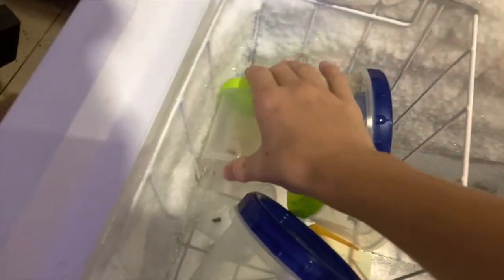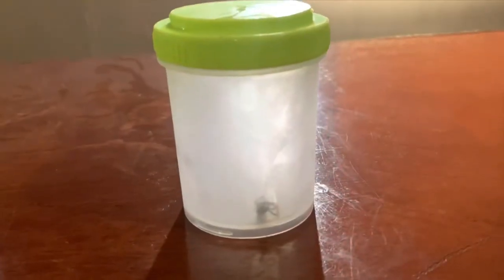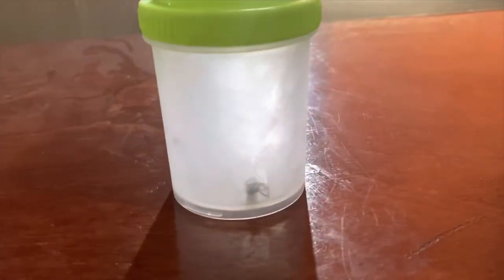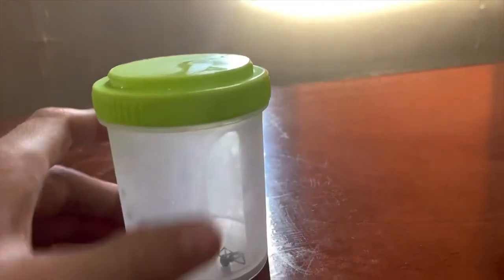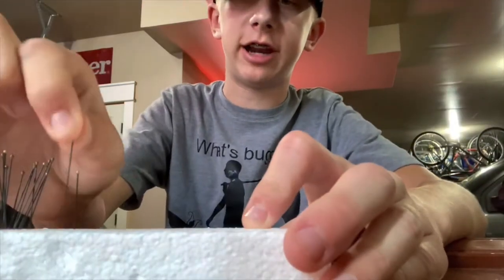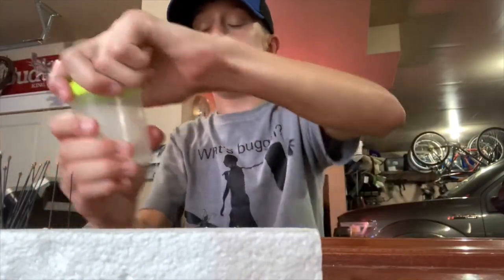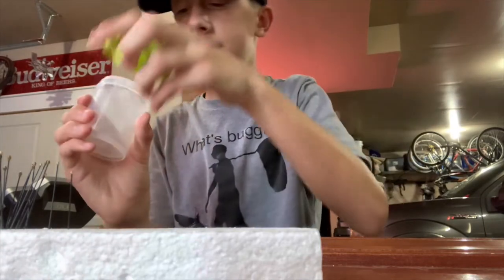The bug I'm going to be preserving in the alcohol specimen is in the freezer right now. This is a black widow — a male. Males look very different from females. Males are not black; they're more of a brown, whitish color, and they have stripes. You'll see once I open this up. I have a block of styrofoam and a couple of insect pins. I'm not going to be pinning it, but I'm going to be spreading out its legs a bit so it looks better.